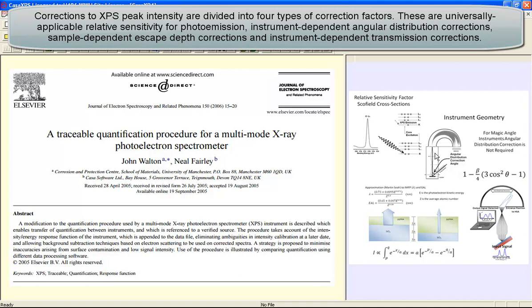We need to account for angular distribution variation, and this is a geometrical relationship of the X-ray source to the direction that electrons are sampled by the instrument.